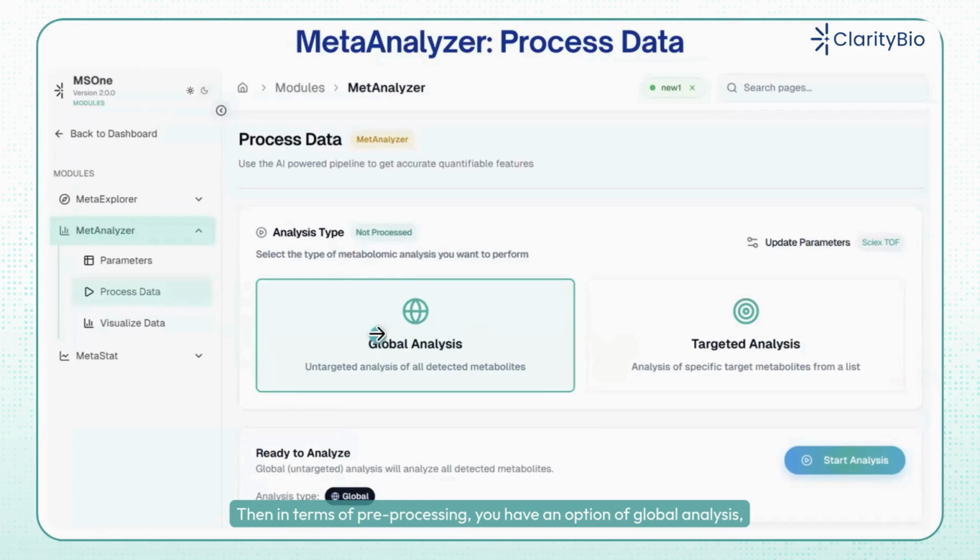All these can be changed by the user. Then in terms of pre-processing, you have an option of global analysis, which is untargeted analysis, or targeted analysis. If you already have an m/z RT list of metabolites that you want to process, then you don't have to go through the global analysis. It would actually be much faster to perform targeted analysis.